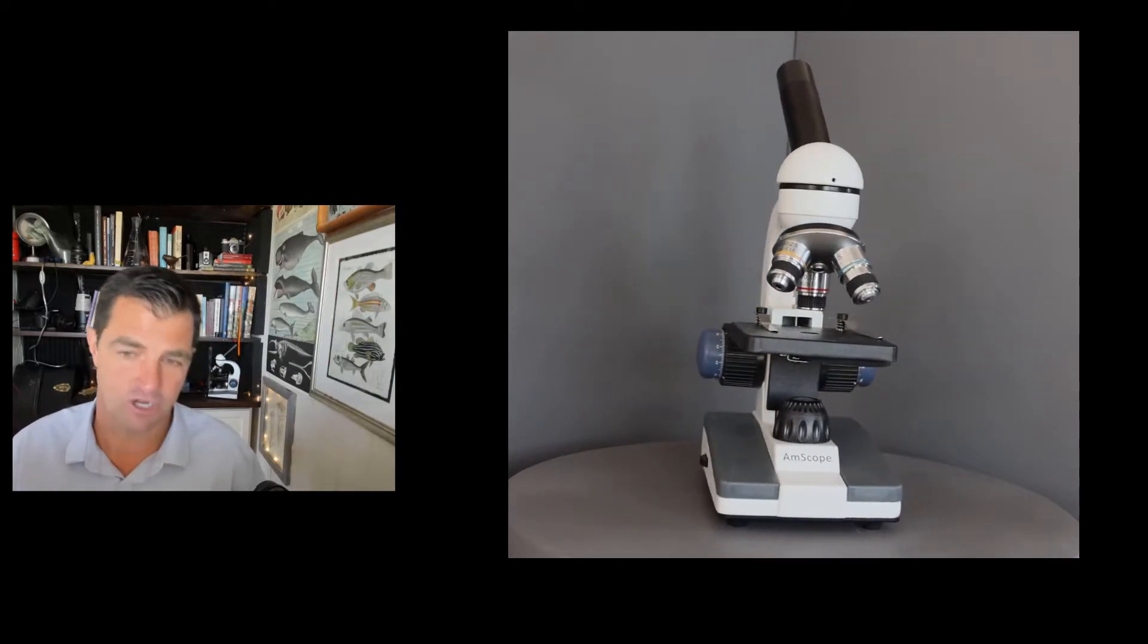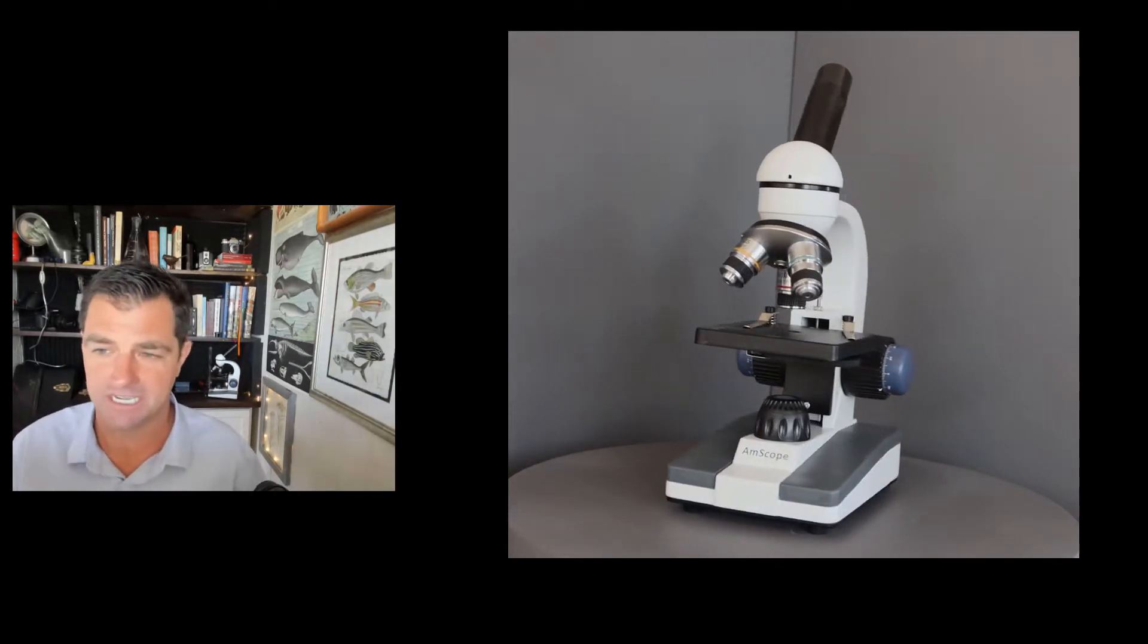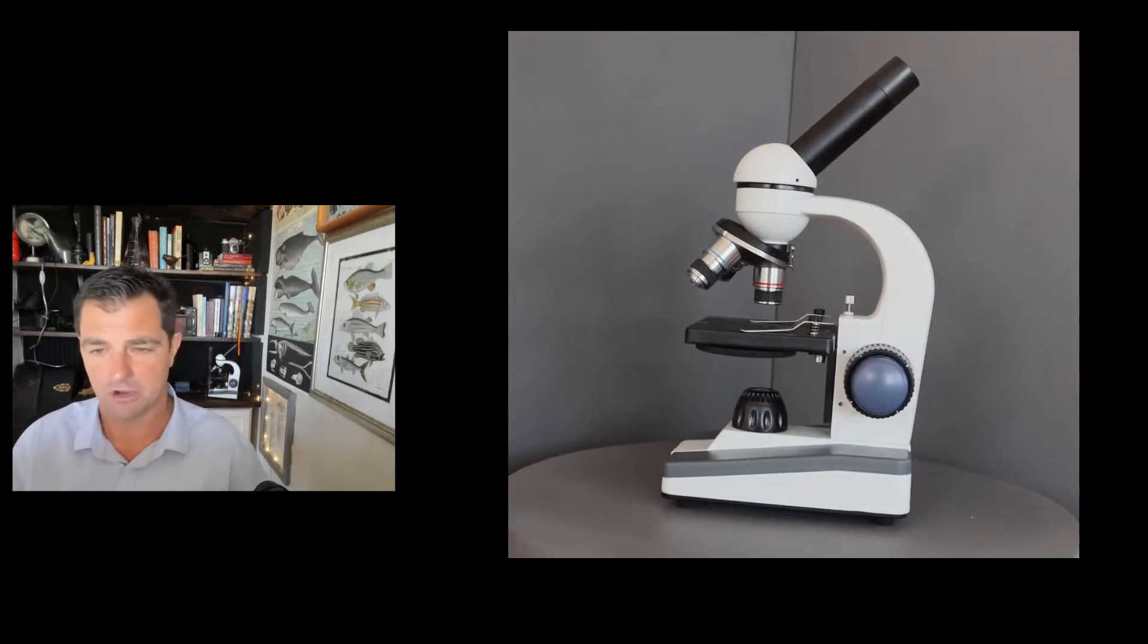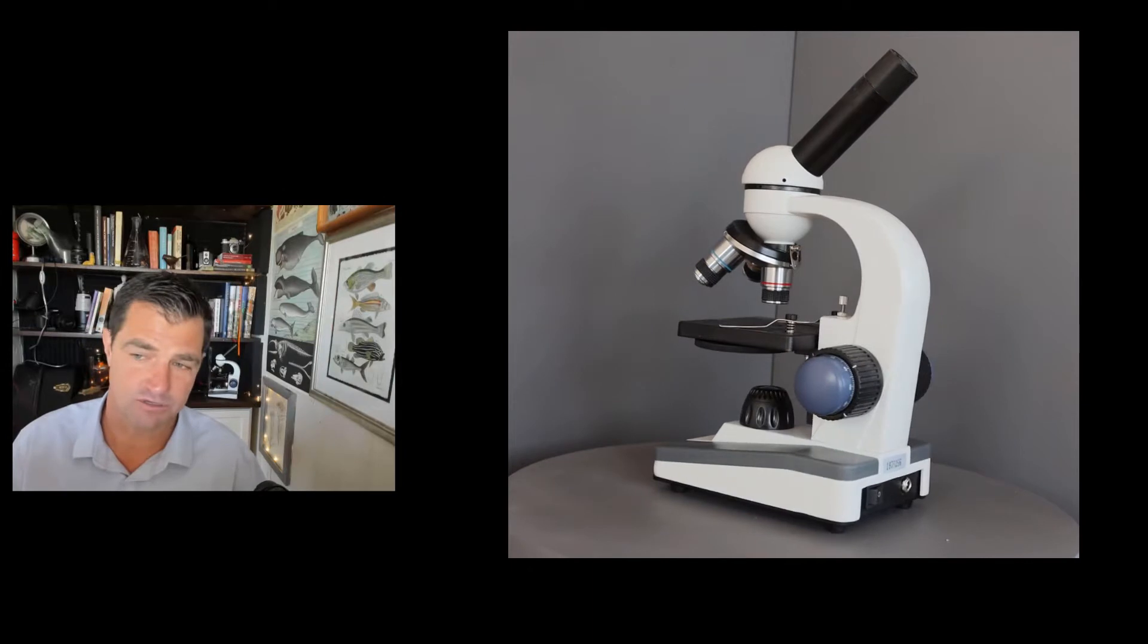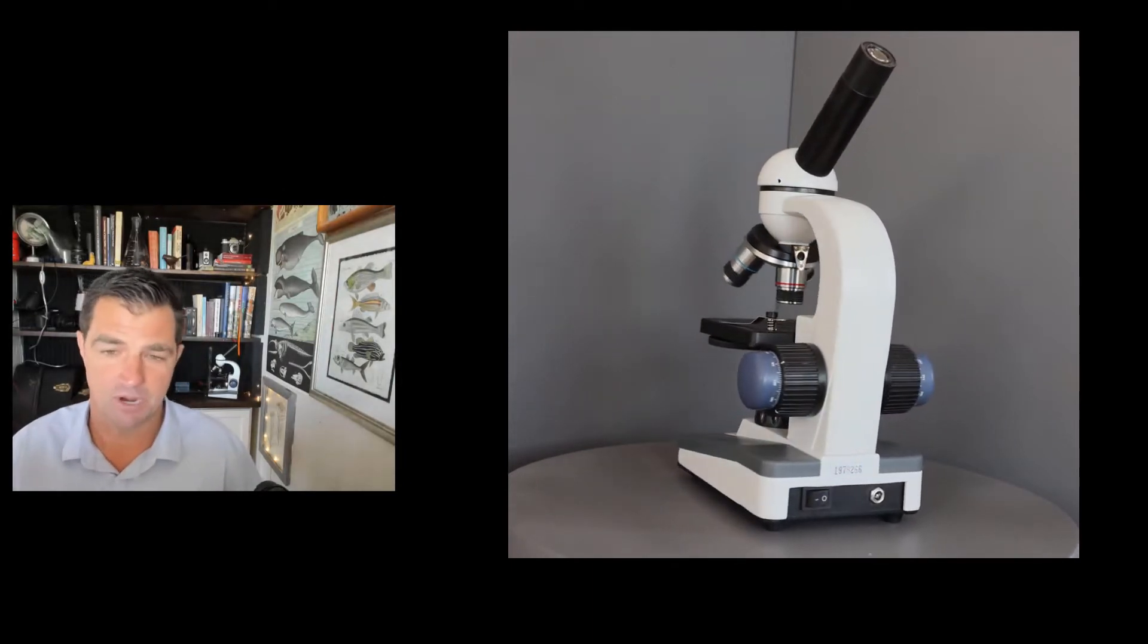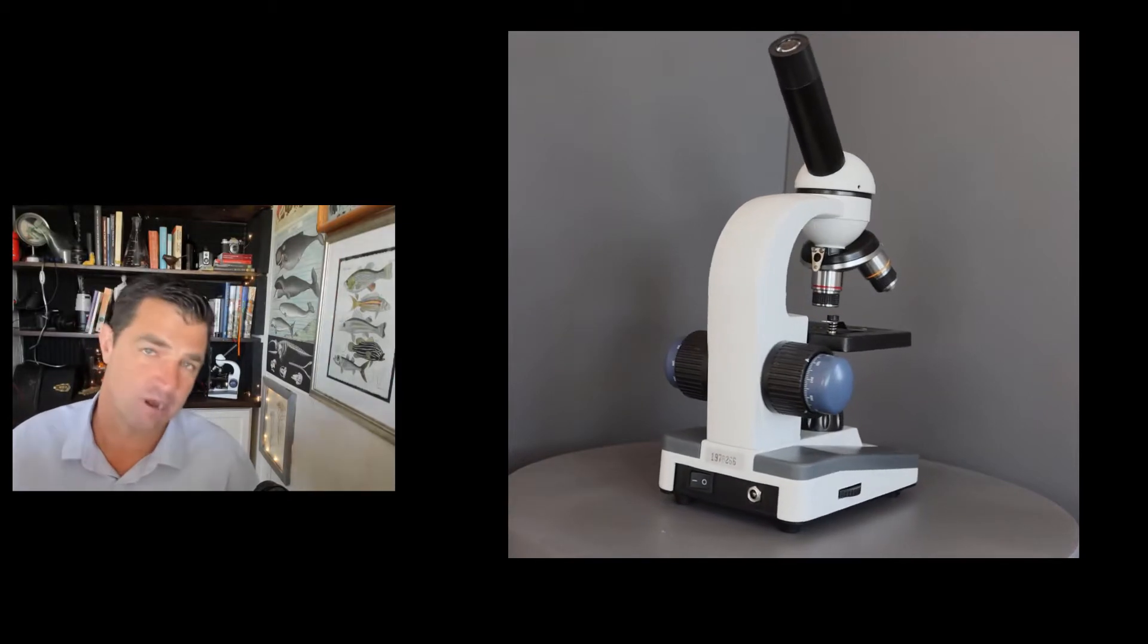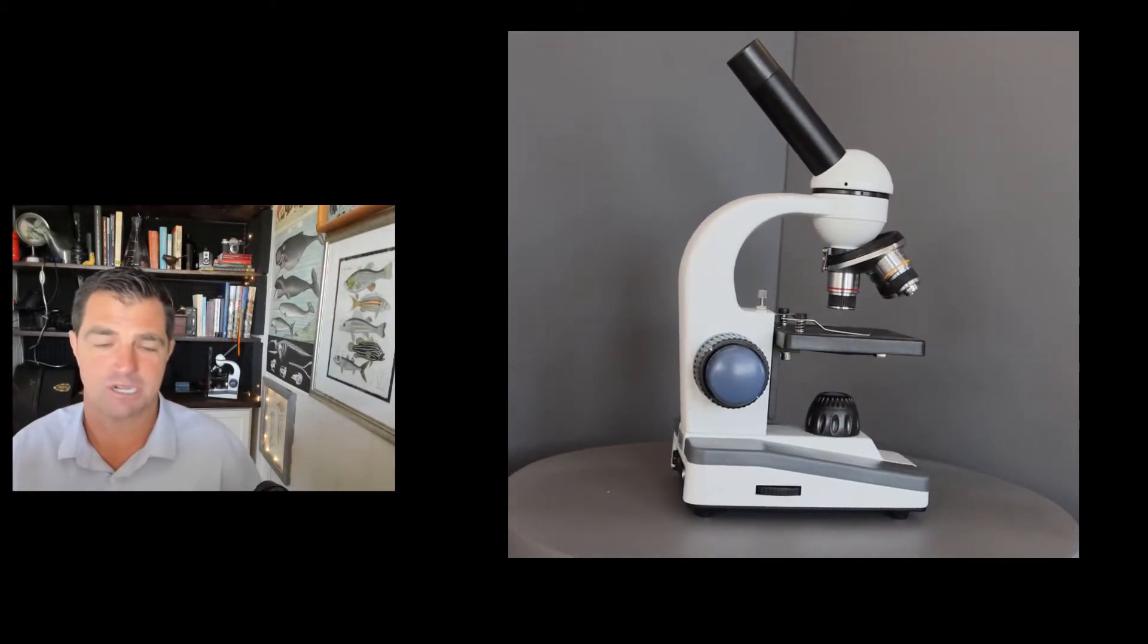This particular microscope, which is from AMSCOPE, it's the M150. I'll put the link up in the comments below if anyone's interested in the model number. This is a standard microscope that we use in our BIO1 class, but these directions will apply to most microscopes of this type, the light microscope type.